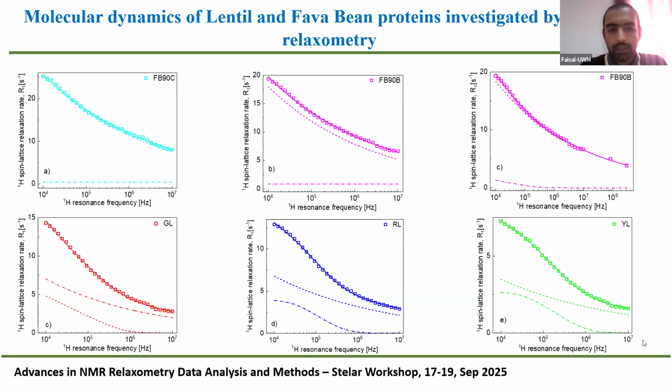So basically when we perform an experiment and are able to measure the magnetization, we were not getting the whole curve. Maybe the end of the curve we are missing, or the start of the curve we are missing. Maybe we can increase it, but we also thought there is a limitation that we cannot increase the tau value, or the RD value, more than 3, because we always used tau values not more than 3 for the safety of our equipment.